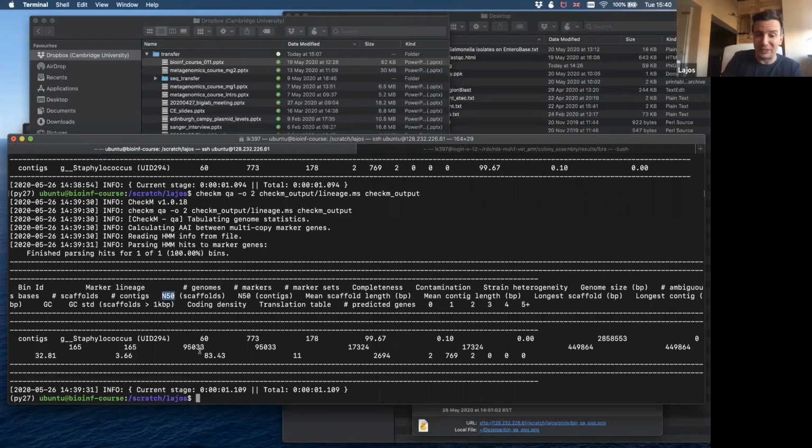It's a bit strange, but it's a good statistical property for your assemblies. Of course, when we do metagenomics, for example, we are very far from these numbers. If you have only one contig because you were able to assemble a whole genome, then of course this will be the length of that one contig.